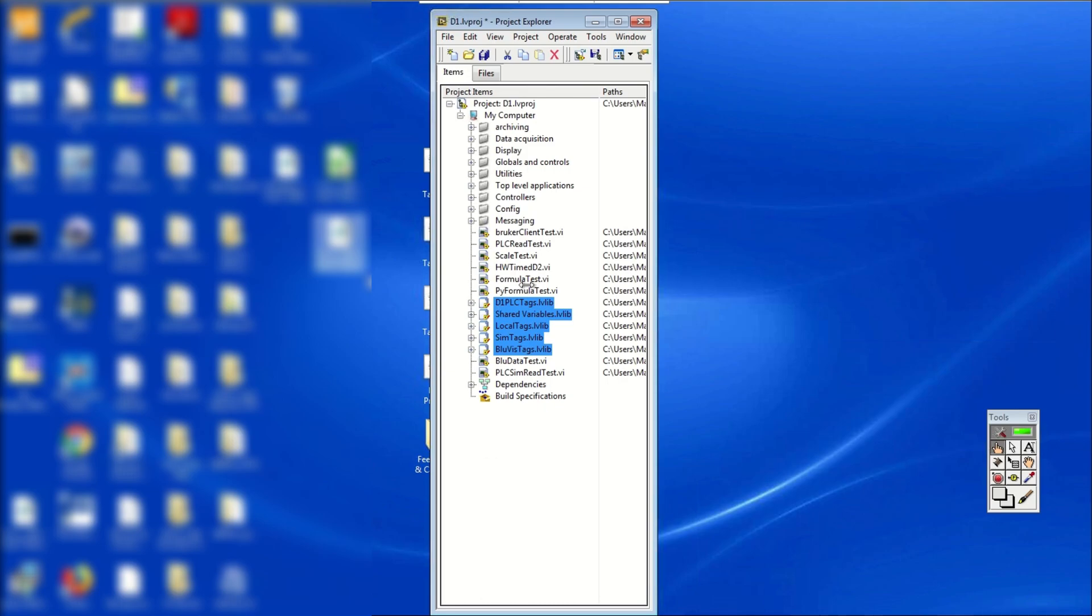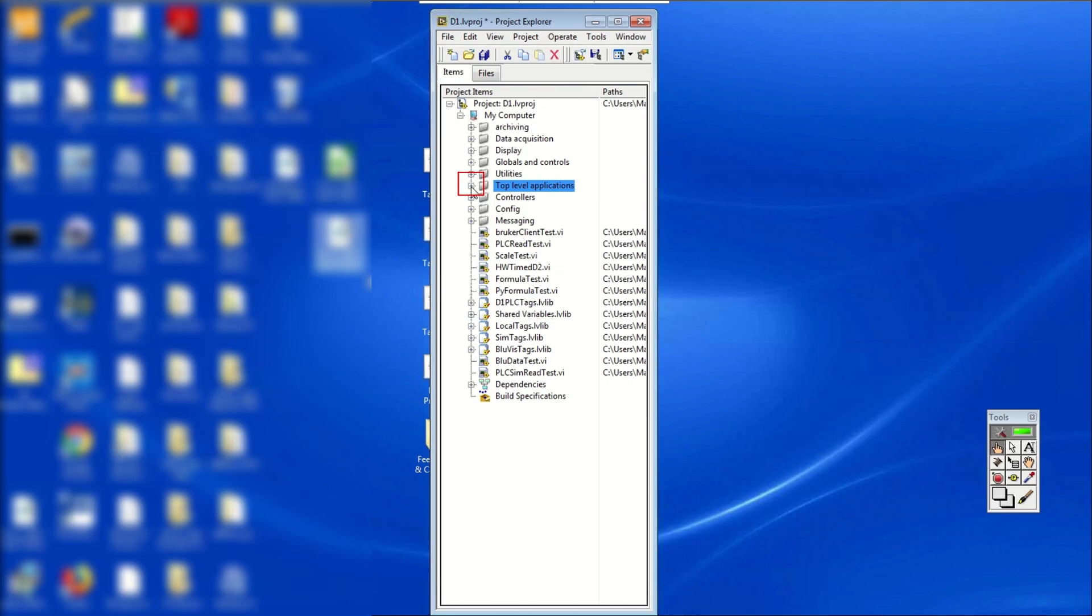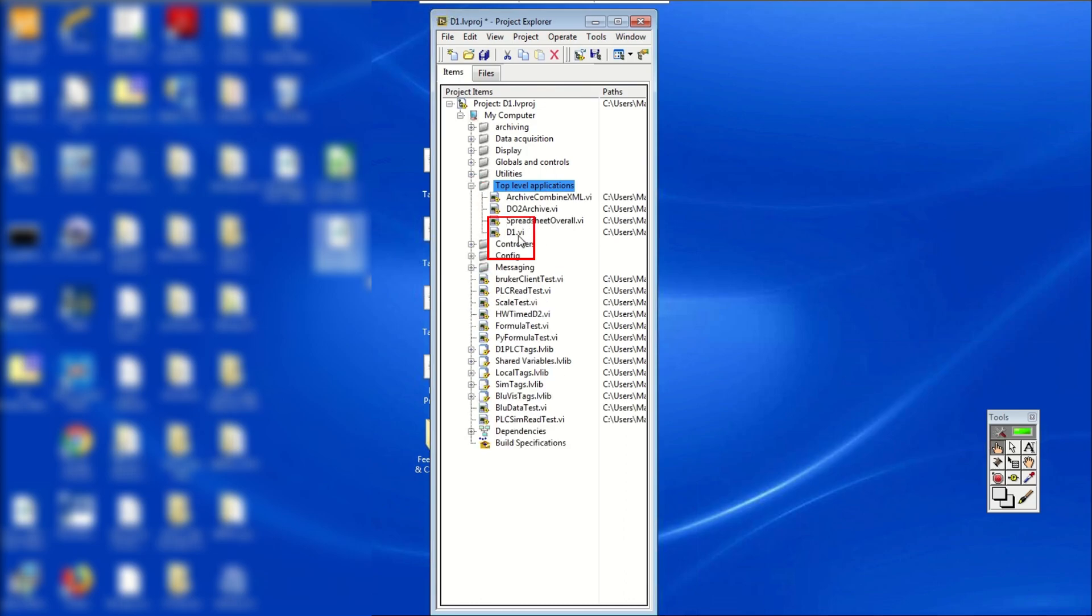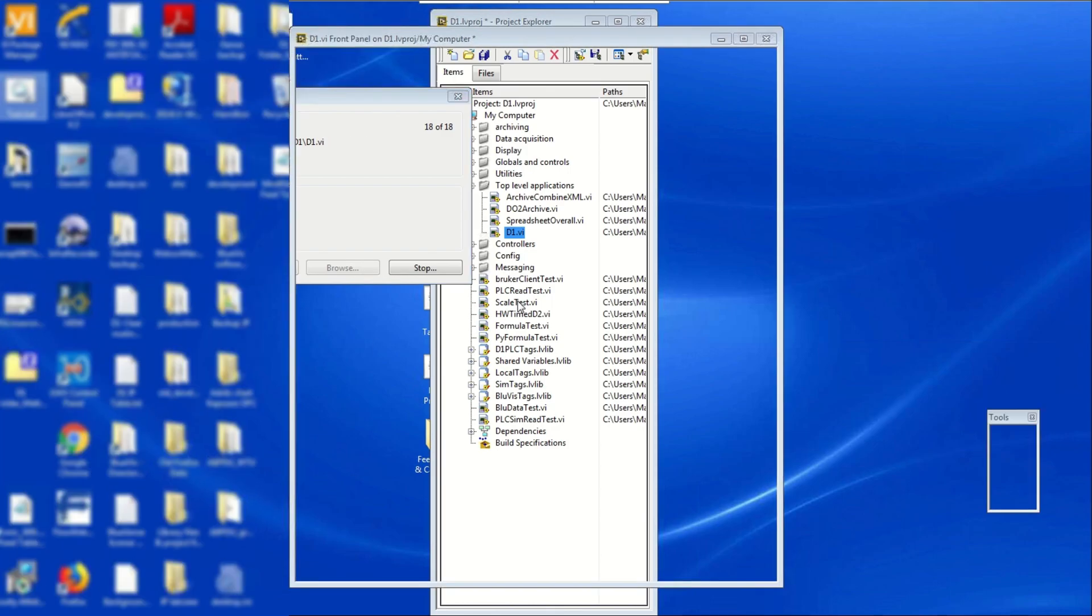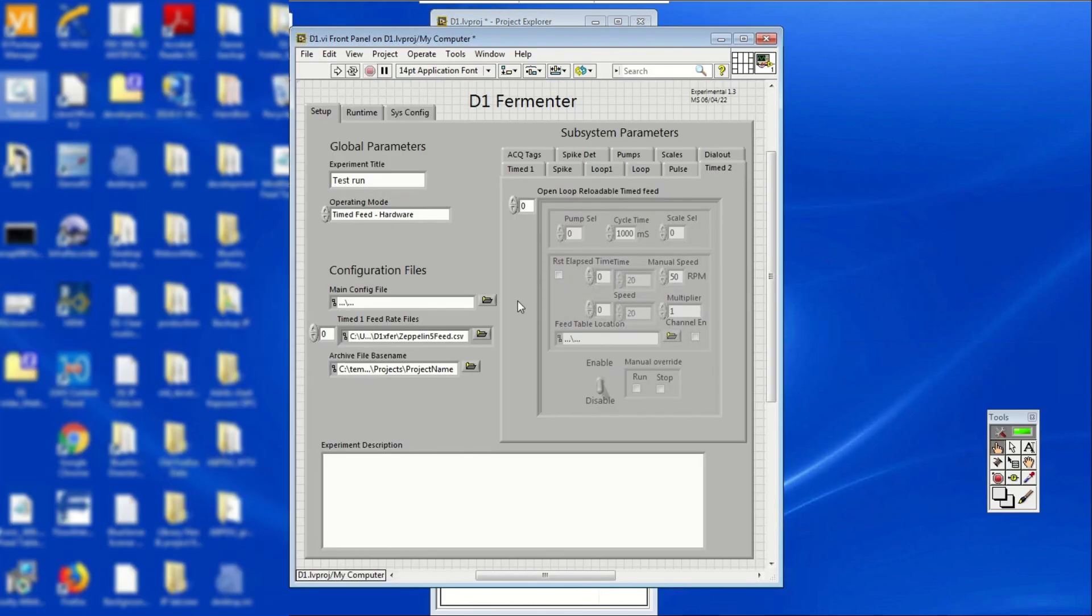In the Project Explorer, find Top Level Application and expand it by clicking the plus sign on its left. Double-click on the D1.vi file. A pop-up window will again appear to show compilation progress. Once complete, the front panel with the equipment's name written in the middle will show up.